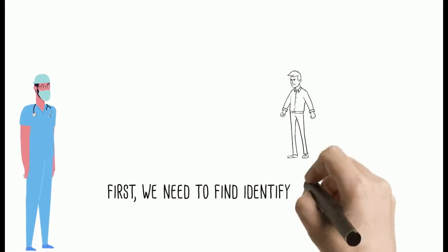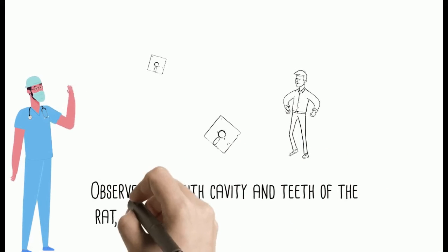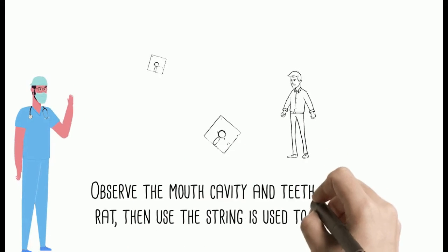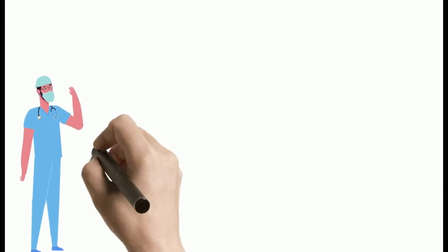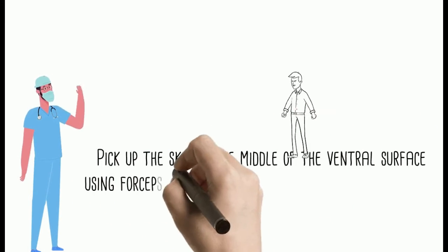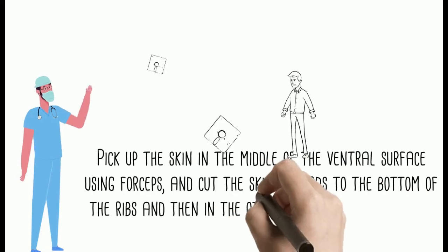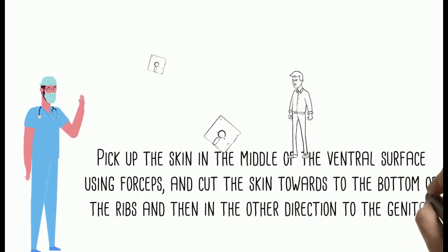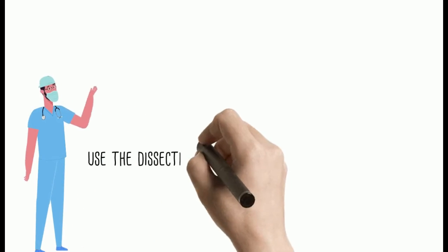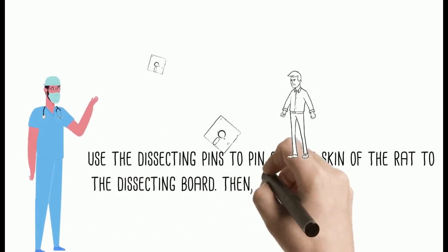First, identify all the external structures visible on the head, thorax, and abdomen of the rat. Next, observe the mouth cavity and teeth. Then use string to fasten the limbs of the rat, pick up the skin in the middle of the ventral surface using forceps, and cut the skin toward the bottom of the ribs and in the other direction to the genital openings. Use dissecting pins to pin out the skin to the dissecting board.